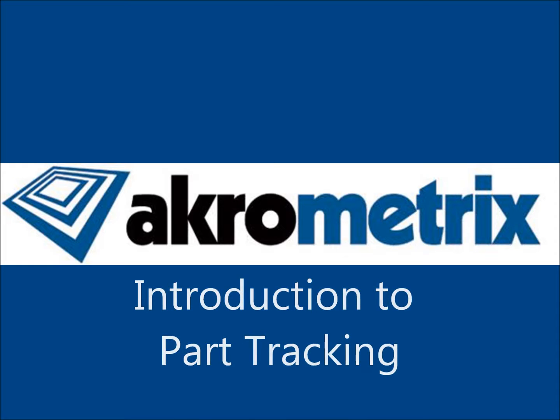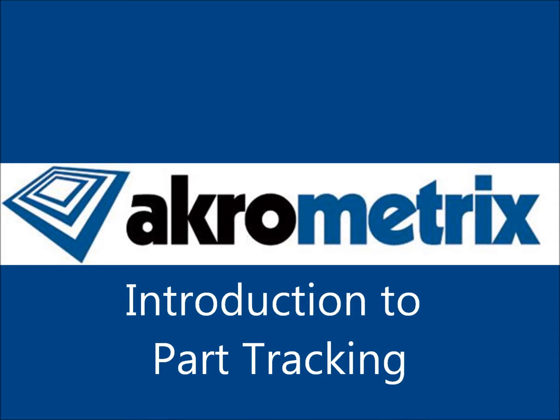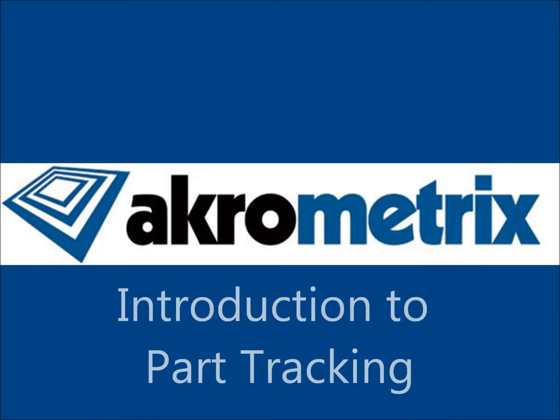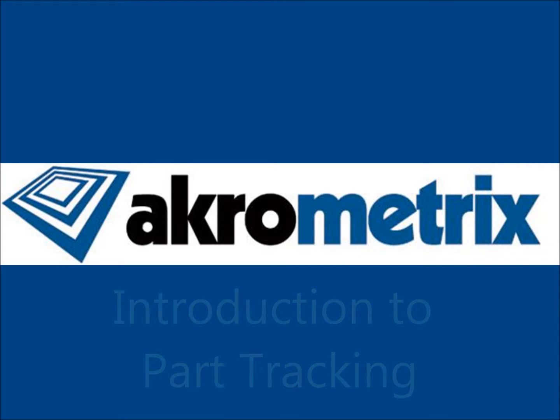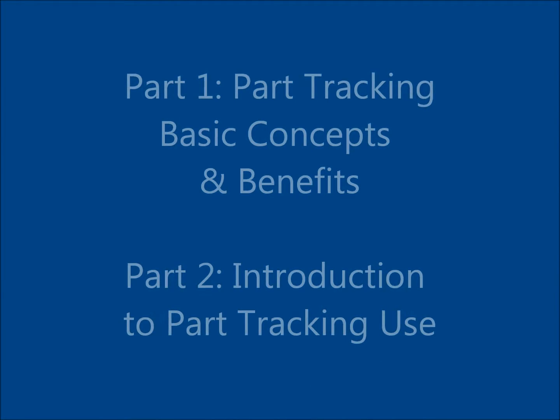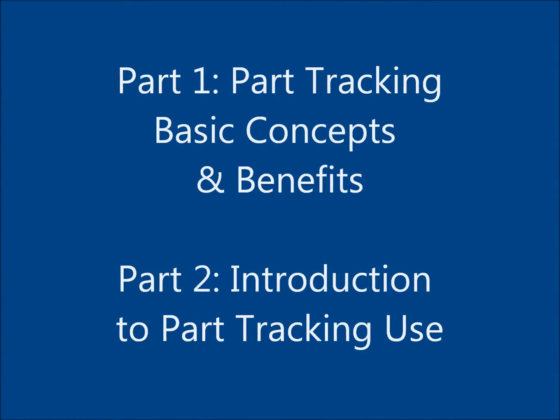Part Tracking is a powerful new software feature available with the 6.0 release of the Studio software platform. All customers currently under Studio software maintenance will be eligible for this new enhancement. This two-part video will cover the basic concepts and benefits of the part tracking feature, followed by an introduction to how part tracking is used.